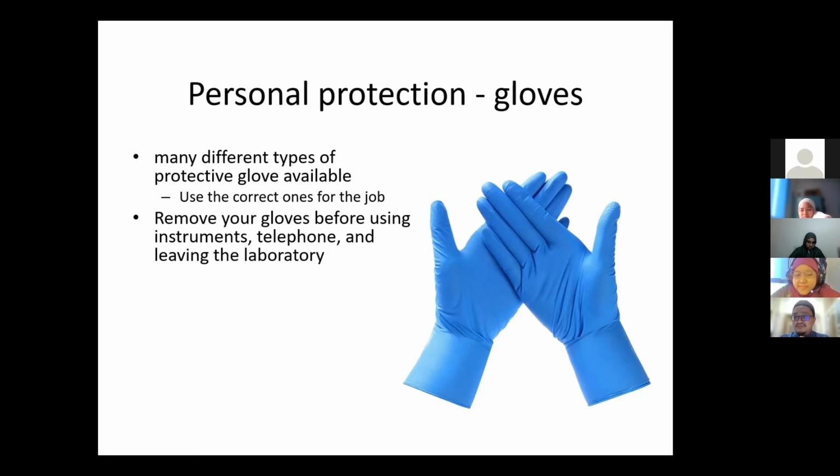You are playing around with lot of samples. Okay, samples blood tu may have HIV, hepatitis, etc. It's not clean basically. And when you do not know, you just splash some blood onto the coat that you are not aware of. If you become a habit that you wear your lab coat to cafes, it will make people uncomfortable. It will introduce infection, etc.